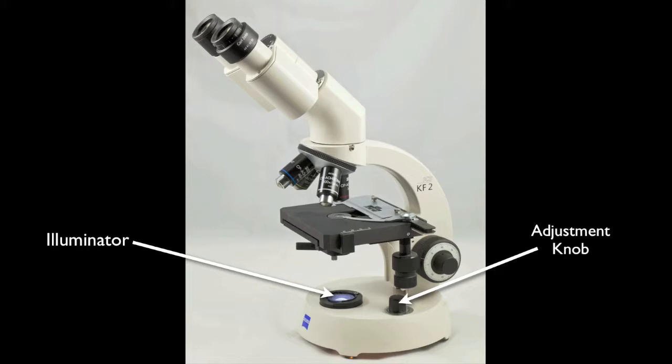The light adjustment knob is located on the right side of the base. This turns the light on and off as well as changing the intensity. You will need to adjust light intensity whenever you move to a different objective lens and to compensate for specimens of differing densities.